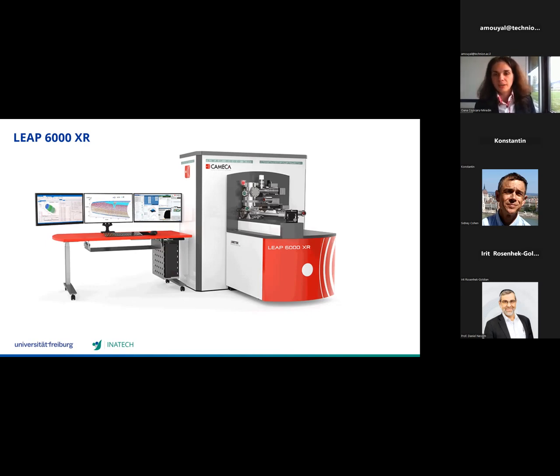And we see that we have three main chambers. We have the load lock, where we insert the sample inside the atom probe, the storage chamber, the buffer chamber, where we store our samples, and we can store up to 35 samples. And we have here in this white box the main chamber with the laser where the experiments are conducted.